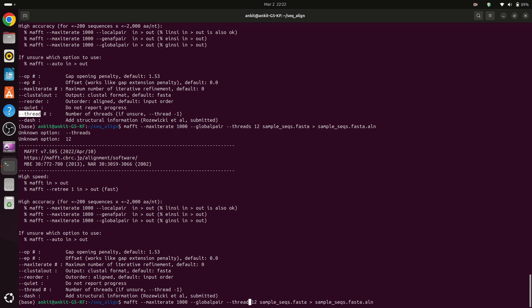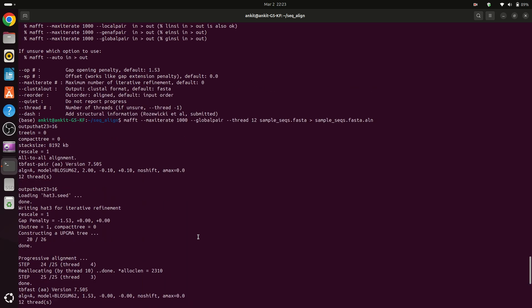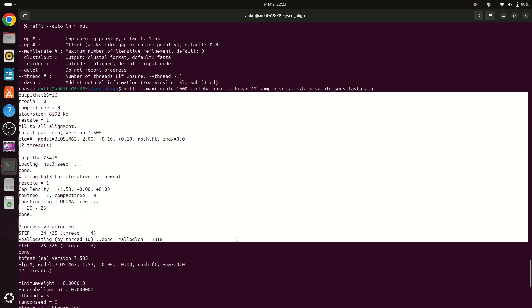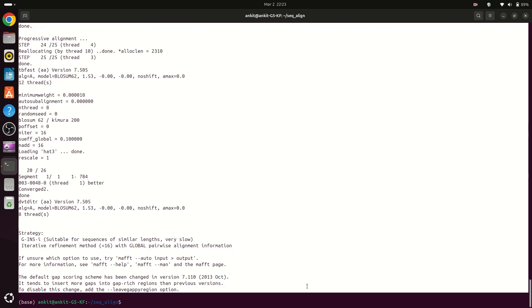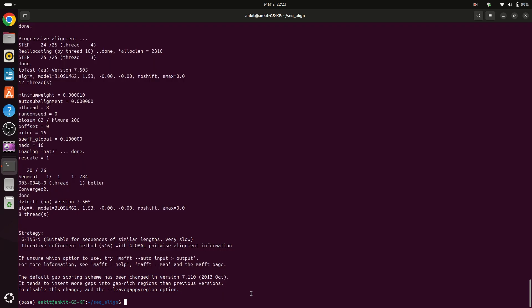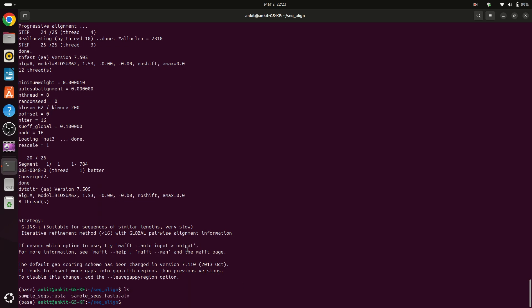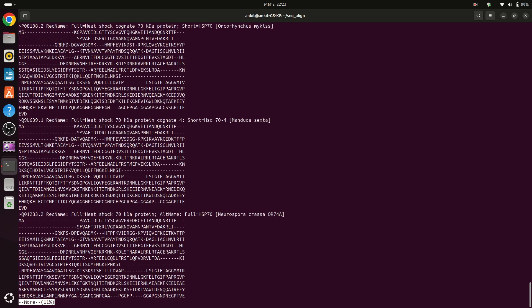So the sequences can be protein sequences, I mean amino acids, or they may be the nucleotide sequences. Now type ls. Now we can see that we have our input file and our output file. So to see output file we can type here more sample.fasta.alignment.